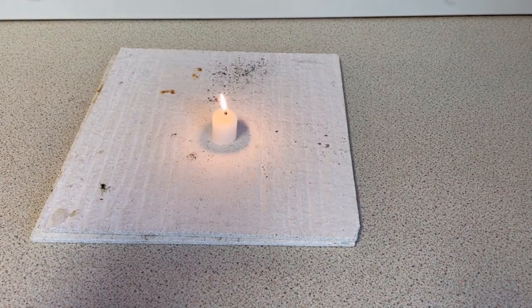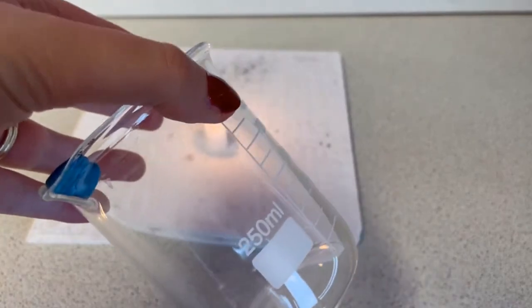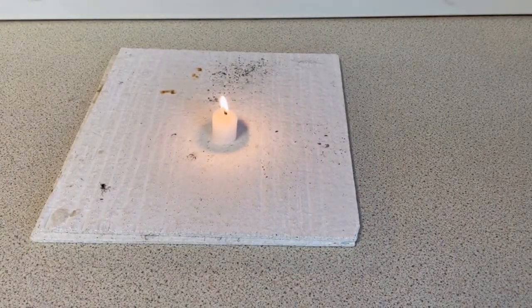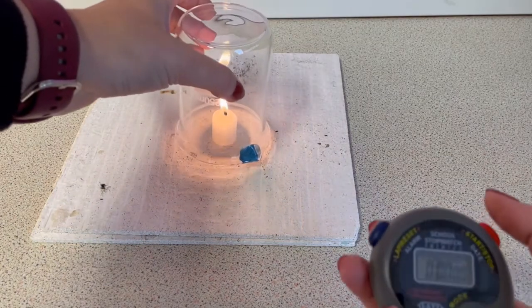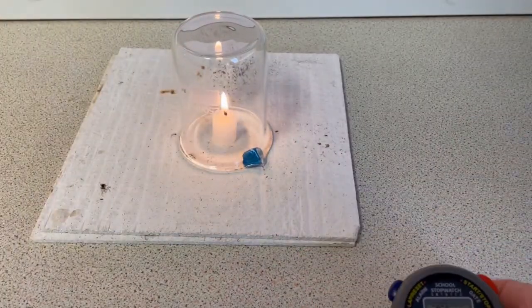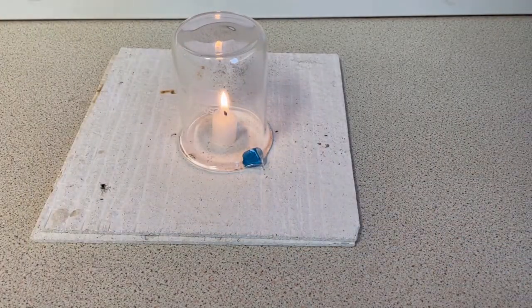Our next measurement will be for a 250 centimetres cubed or millilitres beaker. So again, I'm just going to place that over the candle and time how long it takes for the flame to extinguish.